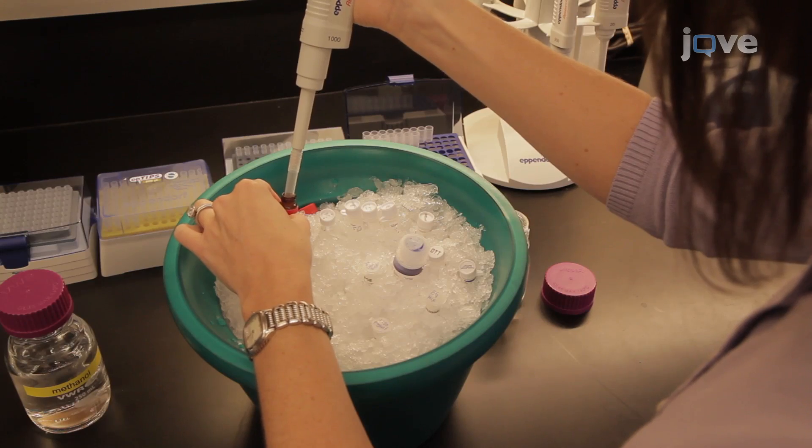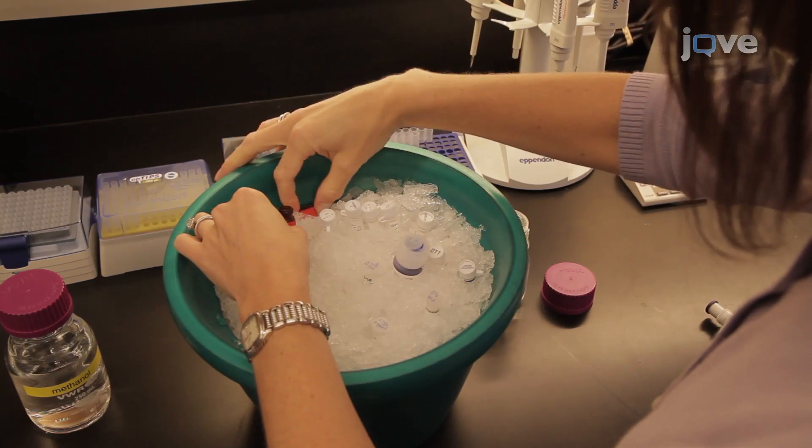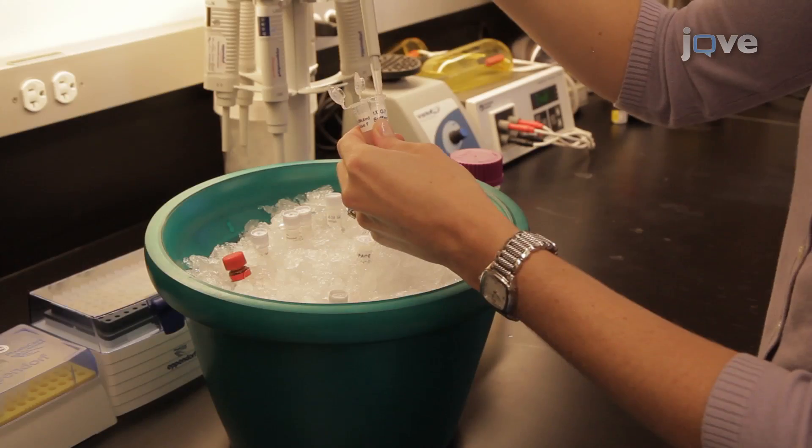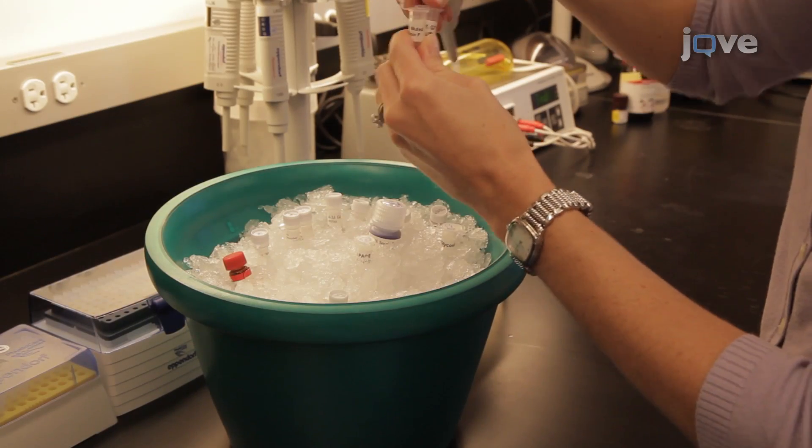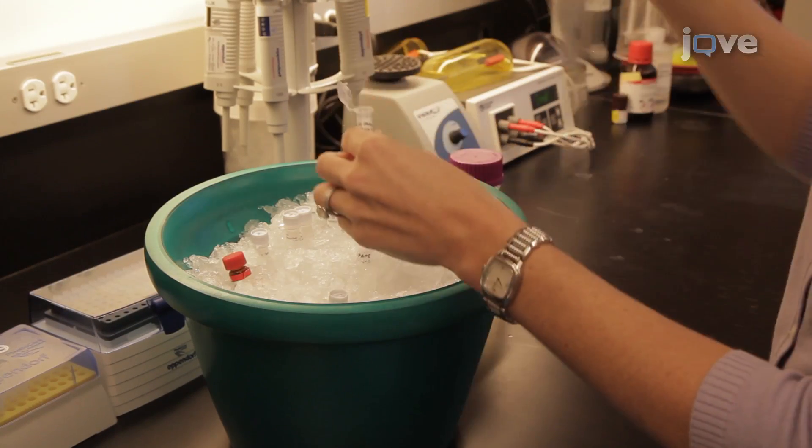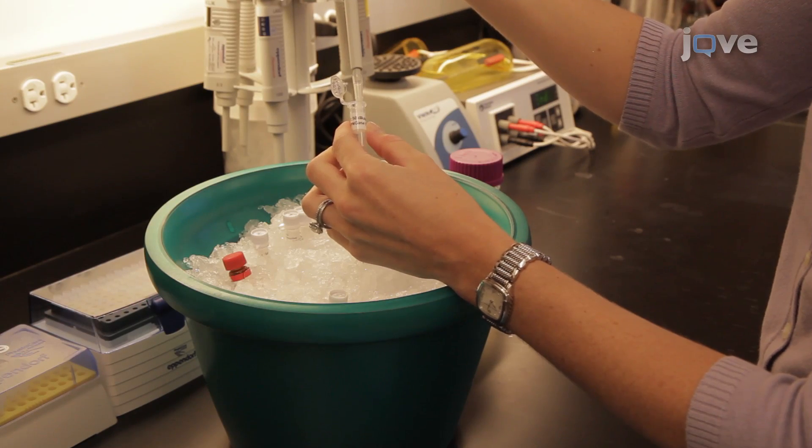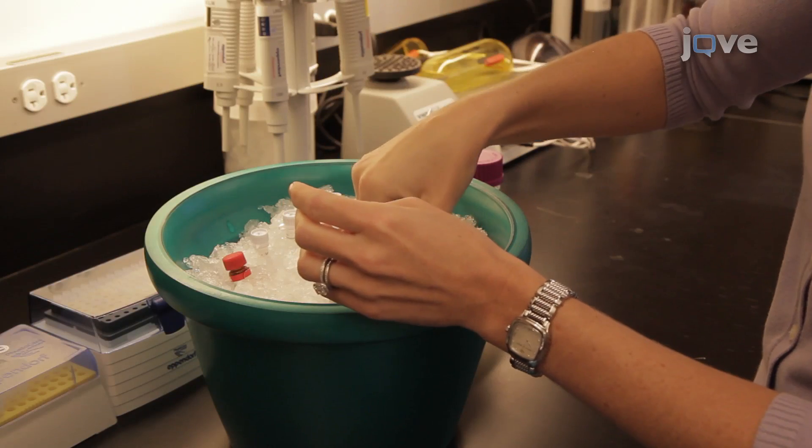Dissolve the contents of the HCG beta vial in 600 microliters of distilled water and keep on ice. After preparing 1 milliliter of 1X G7 buffer by diluting the 10X stock in distilled water, use 25 microliters to dilute 0.5 microliters of PNGase F.